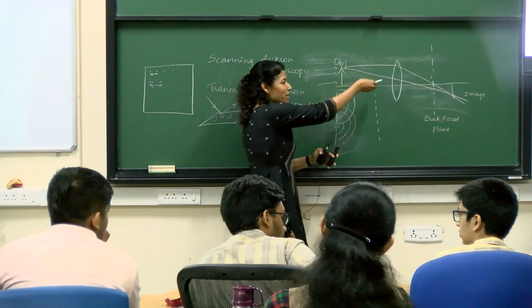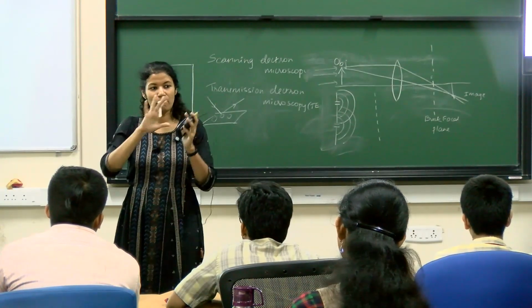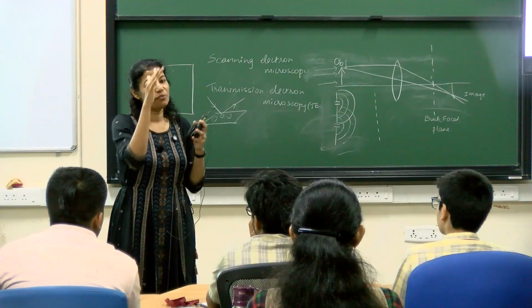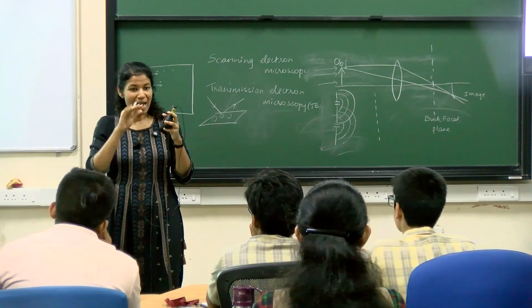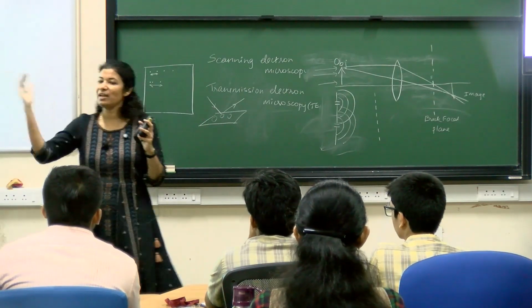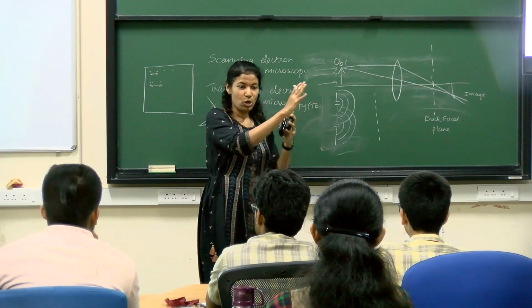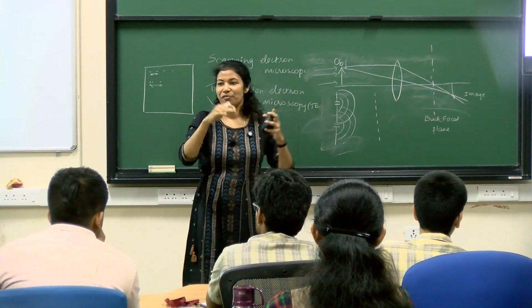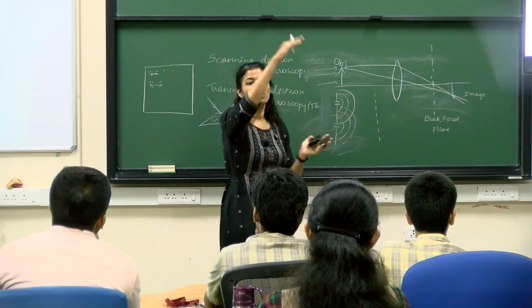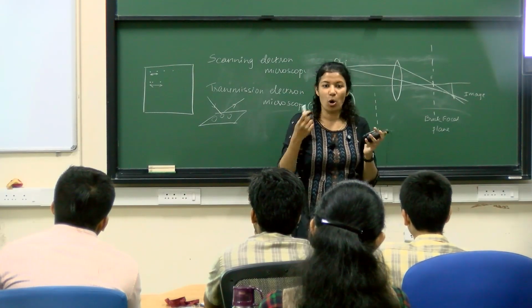Now when image formation happens, that also happens. An object is made up of different atoms, right? So there is interaction of light with these different atoms in an object, and they'll all interact differently. When I have an object, I have a light source, and then there is interaction, and then the light comes out. So they are all now in different phase, different amplitude, everything. This will interact with each other and will cause a magnification. That is what you see as your object.